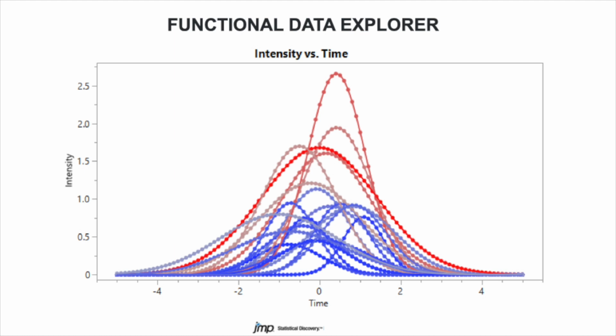Now, the core statistical step that I think is the most important to understand is the functional principal components aspect of the analysis. Functional principal components is very much like vector principal components, in that pretty much everything about functional principal components analysis, you can just take from vector principal components analysis, remove the term vector and replace it with function, and it all goes through.